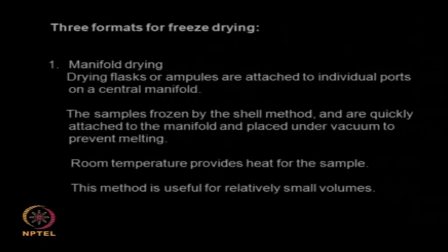So you have to go up in temperature to about 30 to 40 degrees centigrade, and it may take about 4 to 5 hours actually. And if you have a pharmaceutical product, then you may slowly form an ice cake. Generally the cake thickness may be of the order of 1 centimeter. Okay. So there are different types of freeze drying. One is called manifold drying.